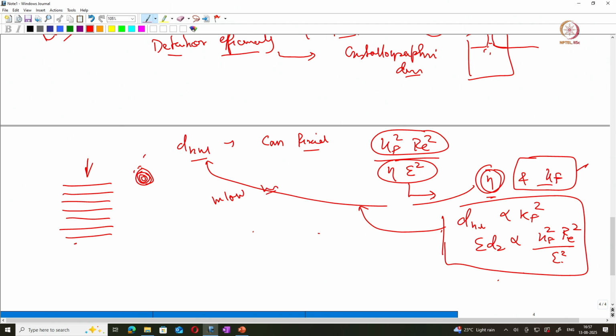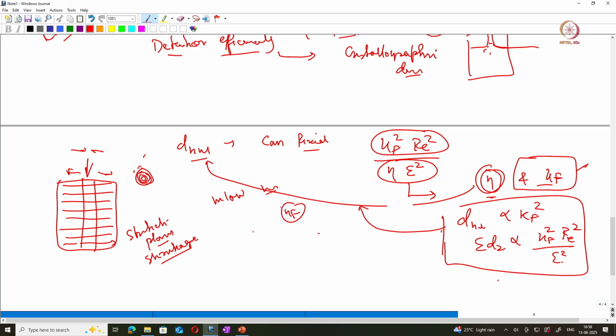There will be a stretching of these planes in the reconstruction. It can also induce shrinking on the lateral dimension of the volume you are analyzing. So if you have a pole here, it might be stretched or shrunk based on a non-accurate value of the KF value.